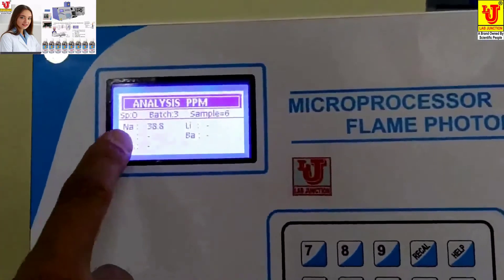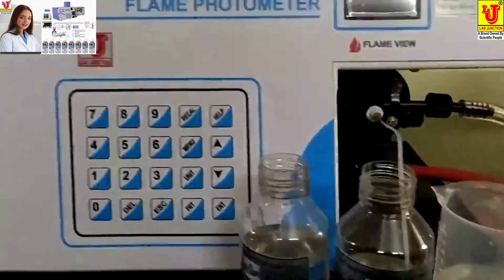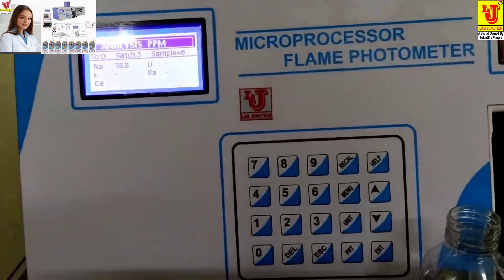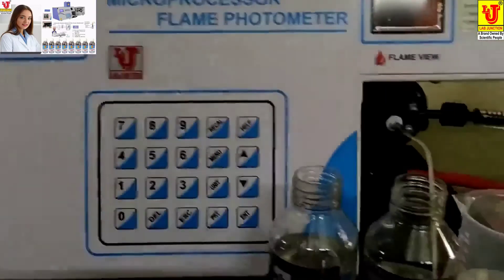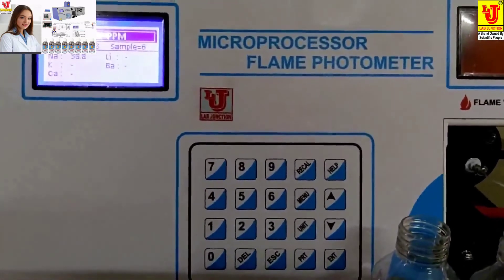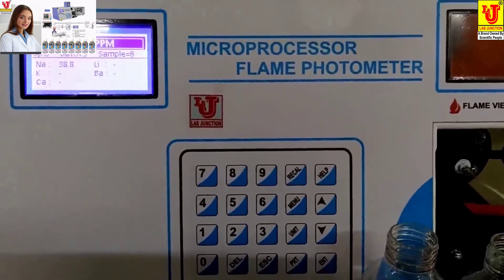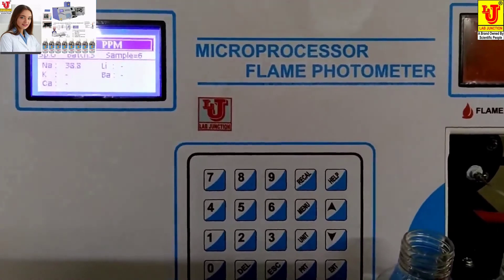This is the final result: 38.8 ppm for the 40 ppm solution. The unit has an accuracy of plus or minus 2%, which means approximately 39 ppm for a 40 ppm solution. The same procedure you have to follow for potassium, calcium, lithium, and barium standard solutions. You can calibrate all 5 filter standard solutions in this way.